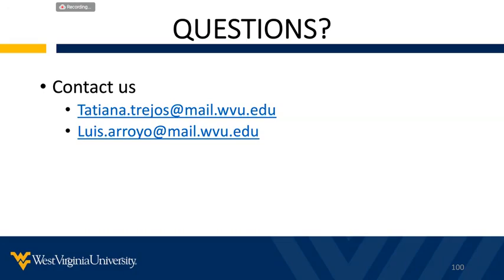Yeah, no, I just want to mention that we also established a direct collaboration with an industry partner. He has, for example, a portable unit, which is also important to demonstrate the transition between what we have developed in the lab and an actual portable miniaturized unit. So I think it will also contribute to the dissemination and the incorporation of this technology in crime labs in the future. Just to add a little bit more info on that.